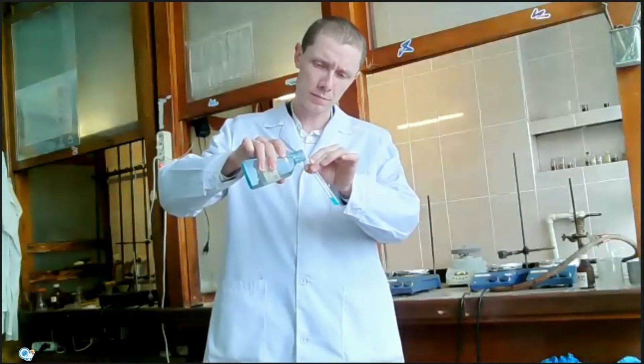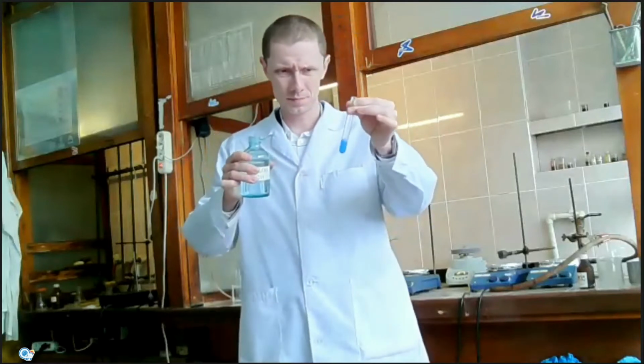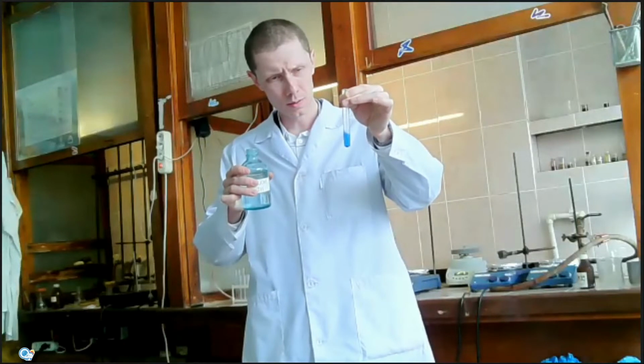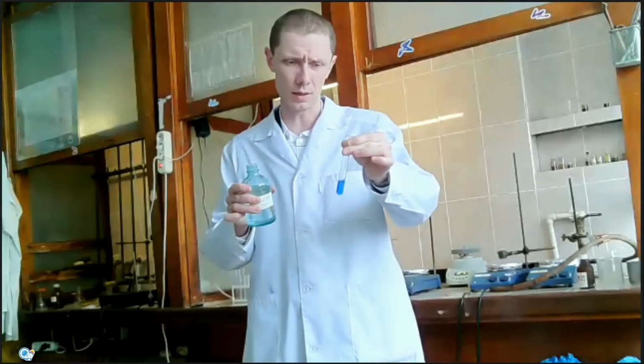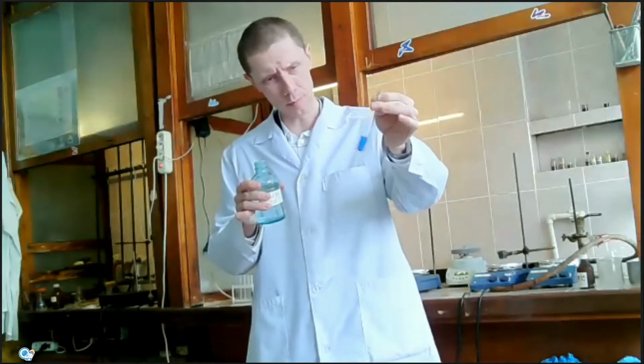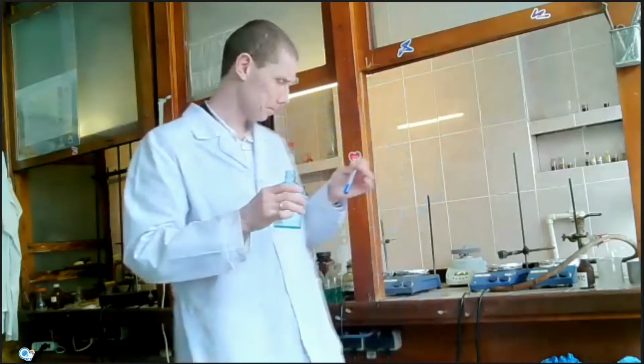Then I add more ammonia solution. The precipitate dissolved, and I can see the formation of blue color complex.